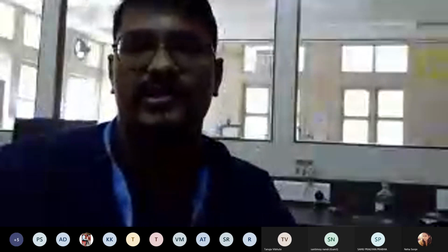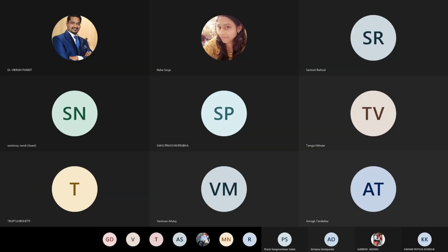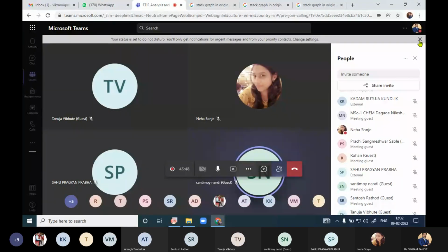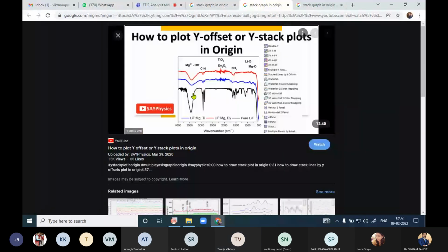For that purpose, I have to share my screen. I'm sharing the screen now. Once I share, if it is visible, just let me know. Is it visible? Yes, sir. Yeah. So see, again, I'm coming to this window, that stacking of graphs.